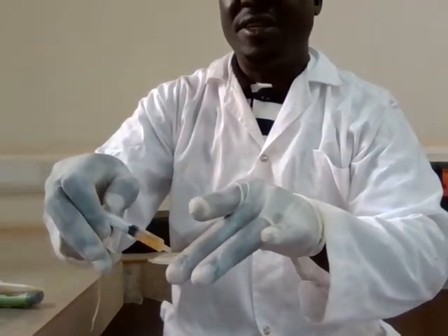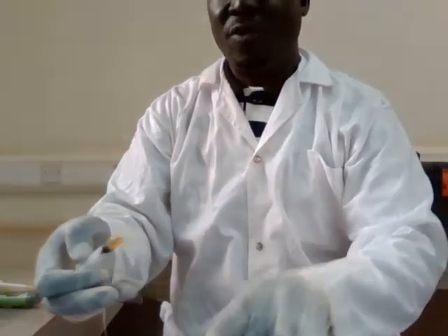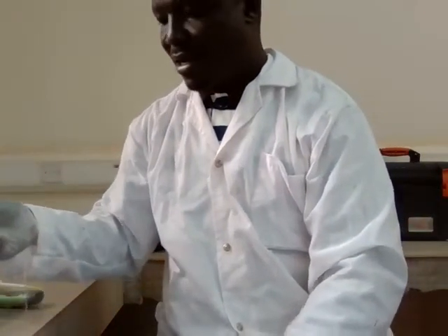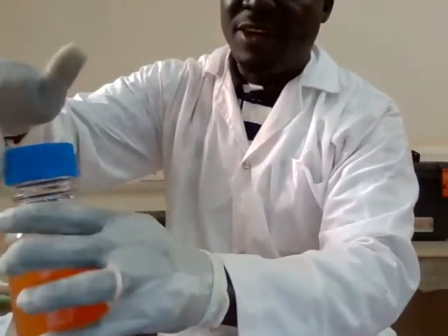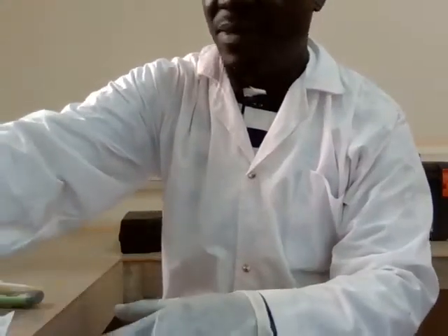Okay. This sterile pad will absorb the media, and then make sure that you cap everything that you have used immediately. Place it in a safe place.